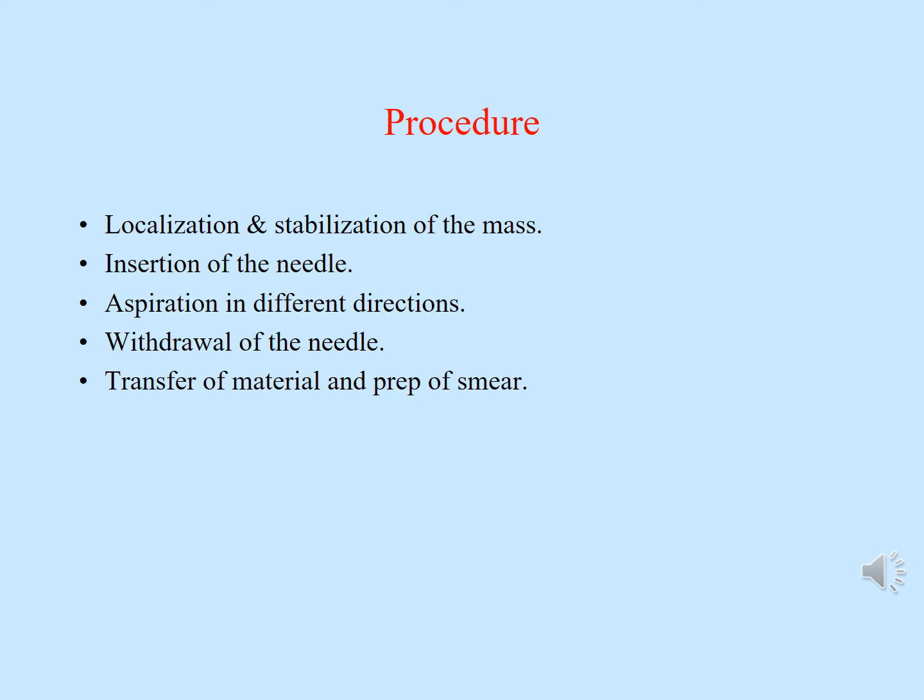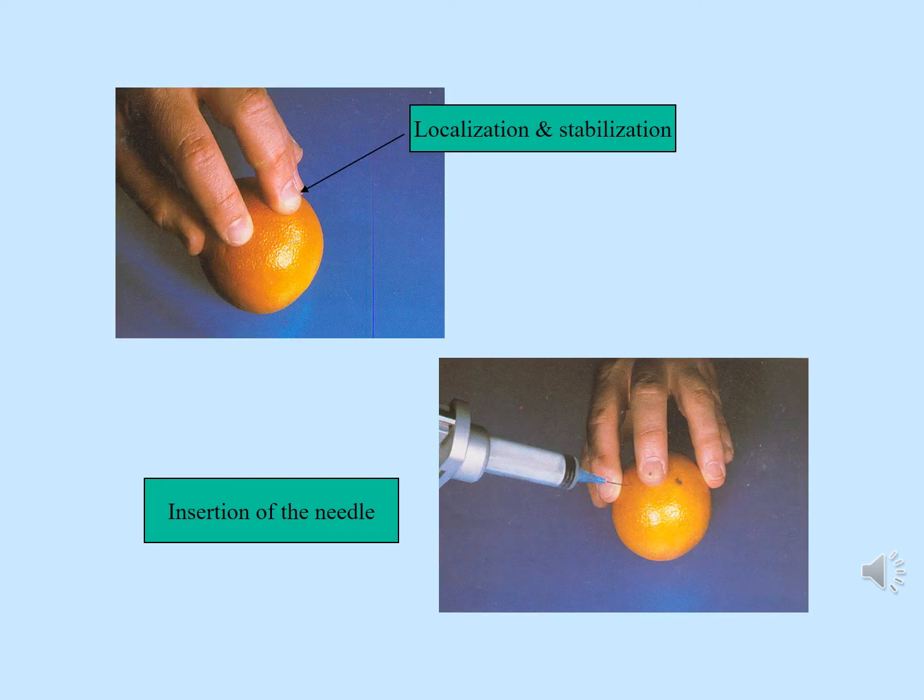Now, as I show you on the next slide, how important is this step here? After aspiration, when you're withdrawing the needle from the lesion and transferring the material is among the most important steps, or rather, this is what makes it a very technique sensitive biopsy technique. So I will explain to you in the following slides.